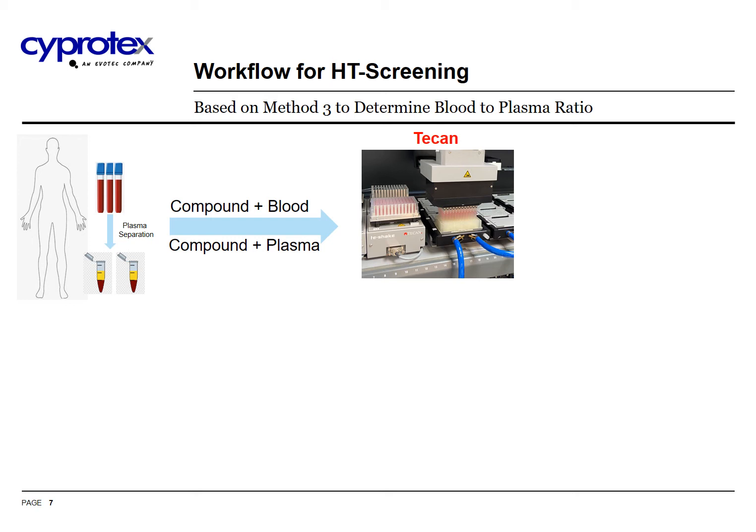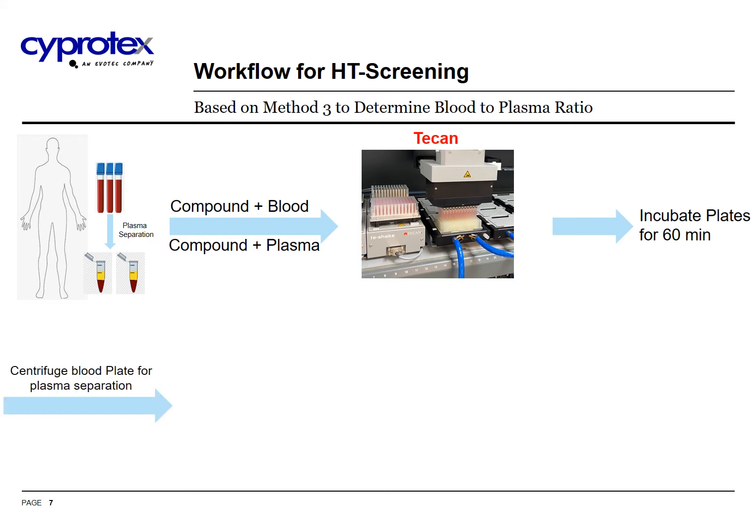Next, using Tecan, the compound is added to the blood and plasma containing 384 well plates. The plates are incubated for 60 minutes. Post-incubation, the blood plate is centrifuged to separate plasma.